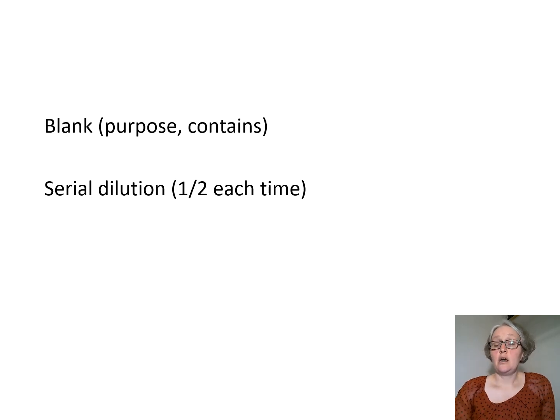So in this case, it had glass, right? We had our test tube, that's going to absorb light. It had water, that's going to absorb light. And it also had Bradford reagent, that's also going to absorb light. What we did was we put that blank tube in the spectrophotometer to zero out the machine or to calibrate the machine. We were telling the machine what it should be ignoring.